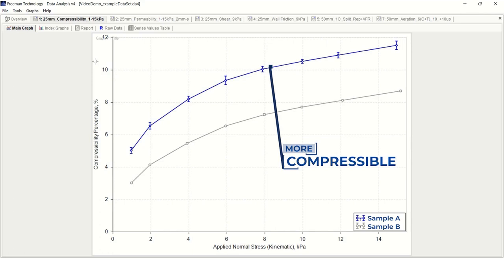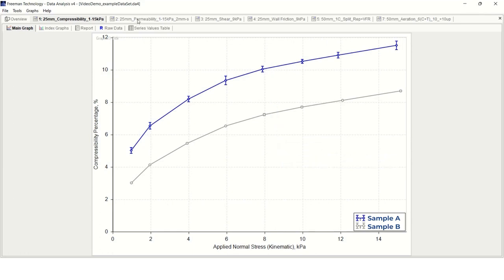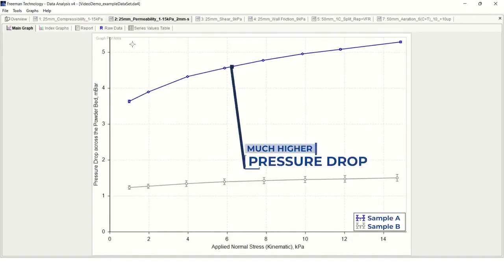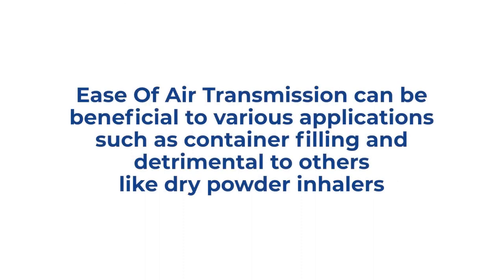Additionally, we can look at the air pressure drop values during a permeability test to characterize how easily entrained air can escape from each sample. In this example, we see that sample A yielded a much higher pressure drop, indicating it is a much less permeable powder compared to sample B. Ease of air transmission can be beneficial for various applications such as container filling or hopper discharge, but detrimental to other applications such as pneumatic conveyance or dry powder inhalers.